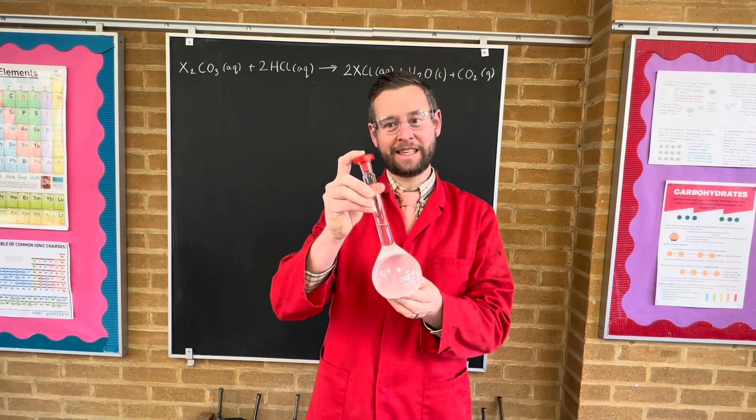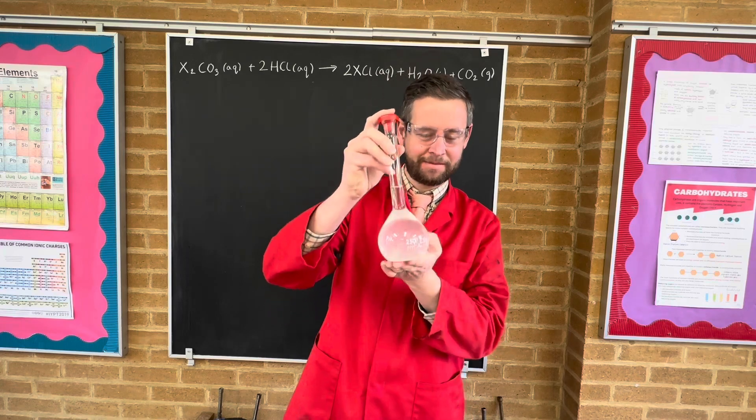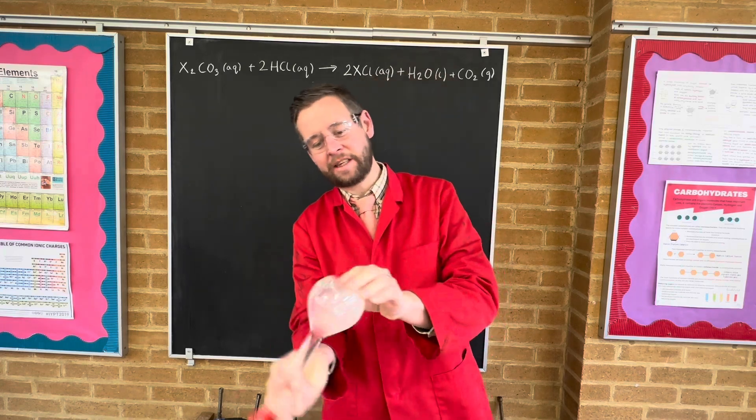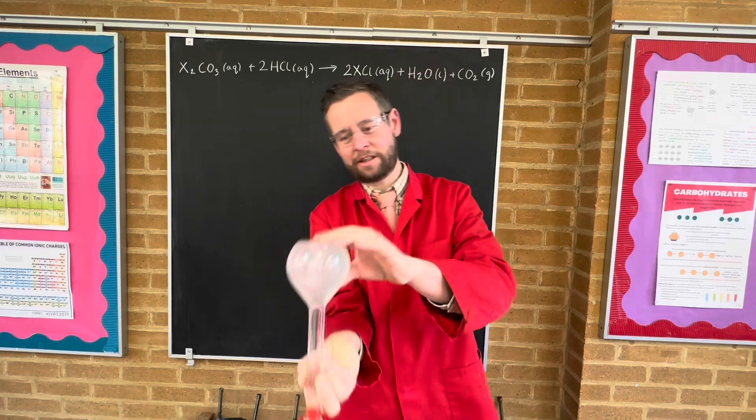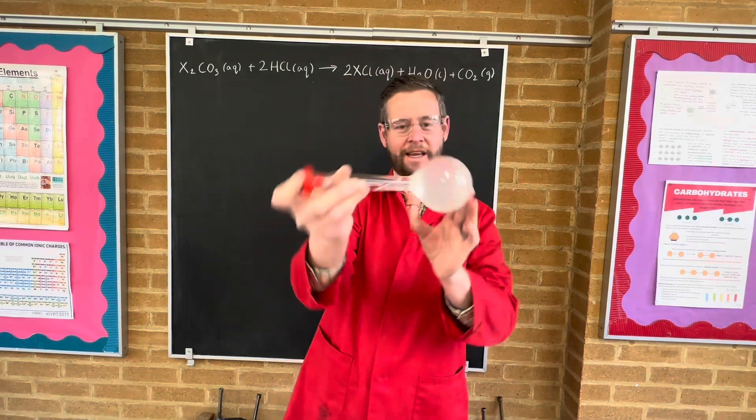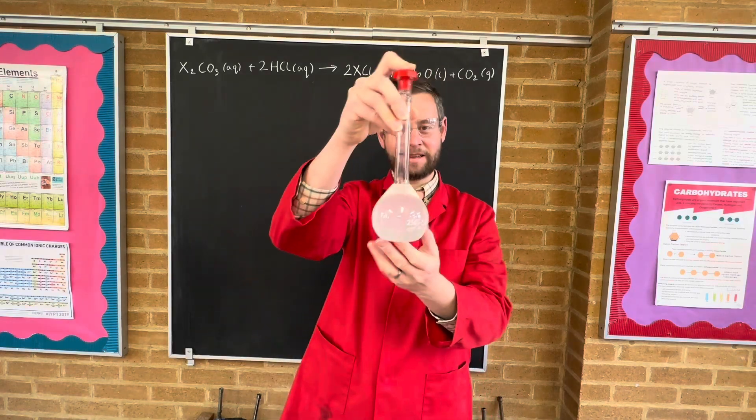And now the fun bit. With a finger on the top, hand on the bottom, we're going to invert it several times just to make sure that that is really well mixed. There we go.